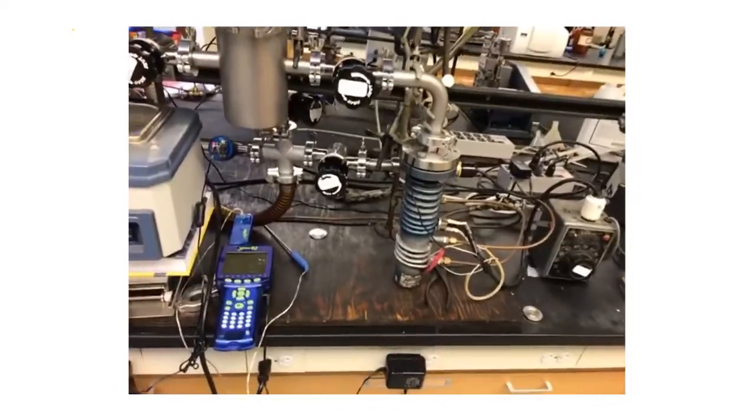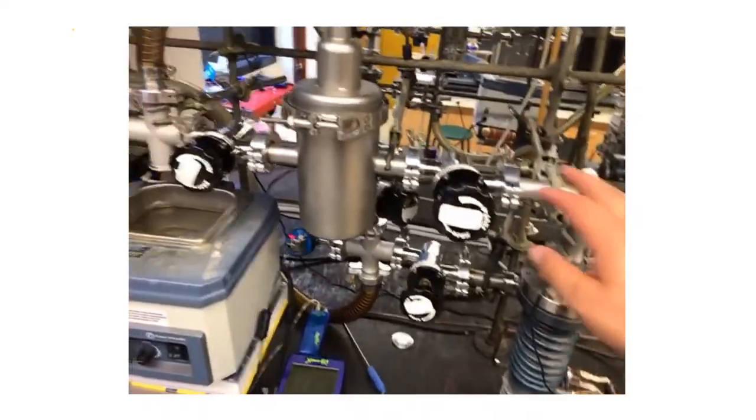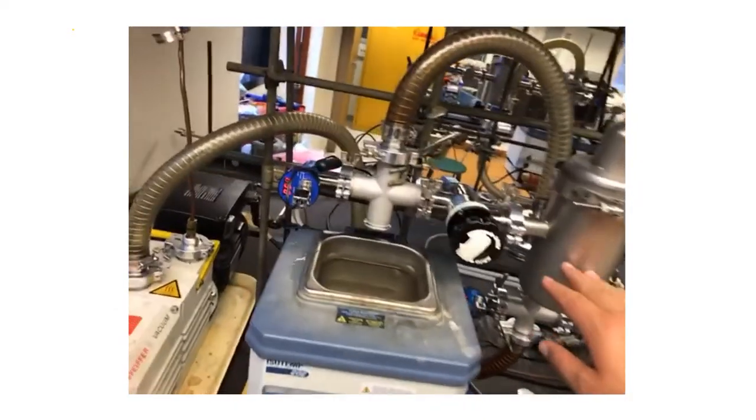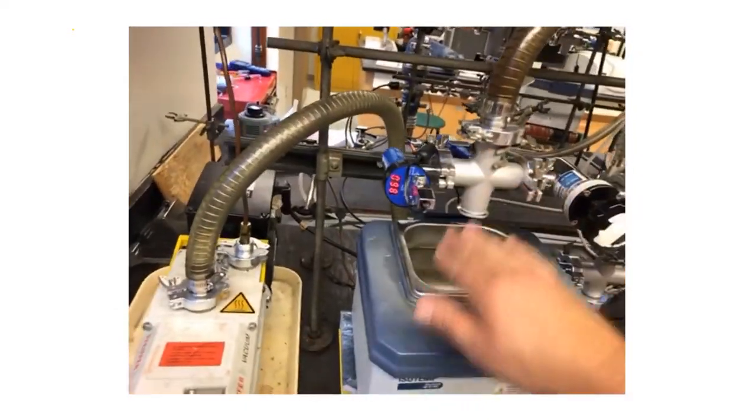exhaust of our diffusion pump, which is then connected to a liquid nitrogen trap, which then leads to what we call the sublimation region.